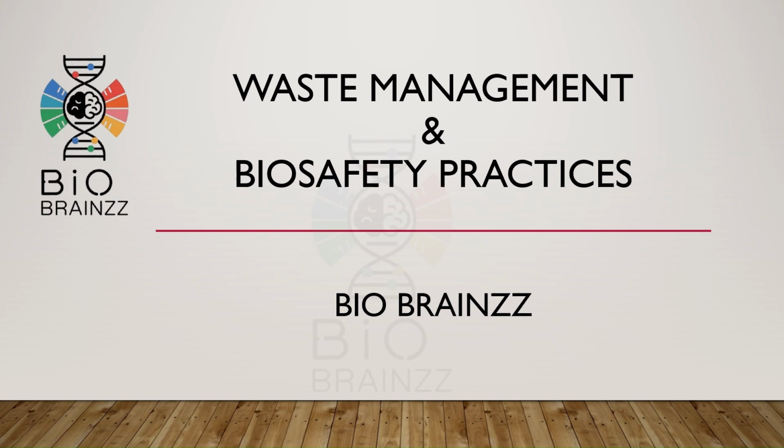In this video, we are going to discuss waste management and biosafety practices in laboratories. Proper waste management and biosafety are extremely important in laboratory operations because laboratories generate chemical, biological, and hazardous waste regularly. Improper handling and disposal can create health risks, contamination, and environmental damage. In this session, we will understand different waste categories, disposal methods, biosafety principles, and GLP requirements.